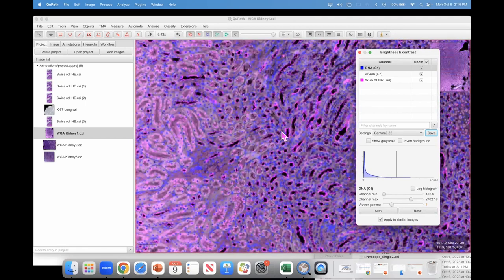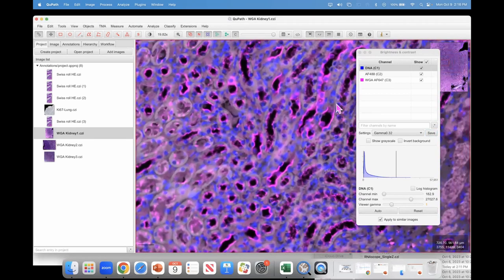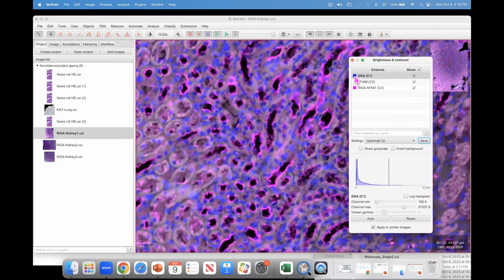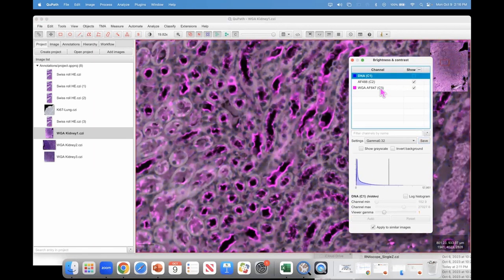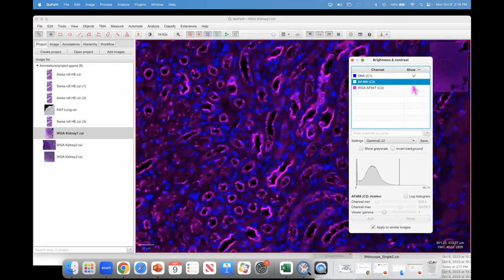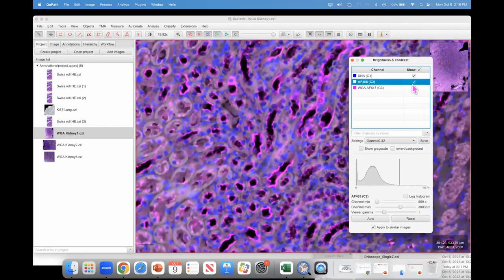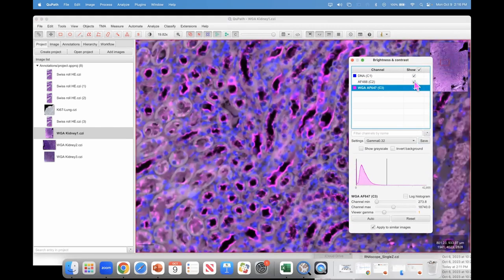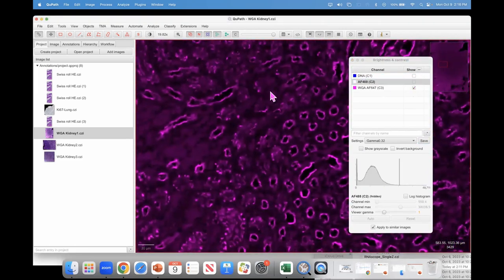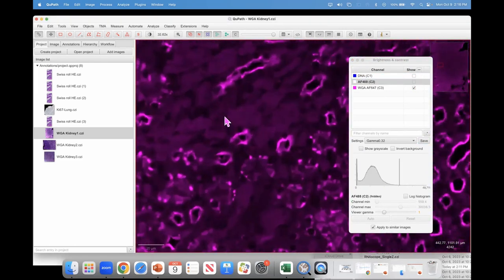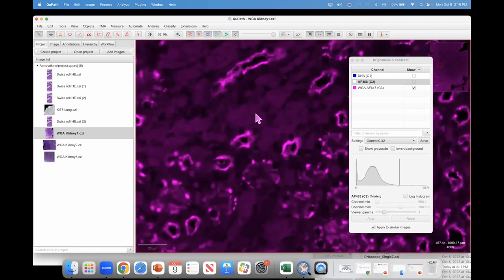Let's zoom in a little bit and quickly talk about the channels in this image. We have a DNA marker — we can show or hide it. Keyboard key 1 toggles that channel, key 2 toggles the second channel which is autofluorescence, and key 3 is the third channel. My question to you is: is this a real staining or is it an artifact?